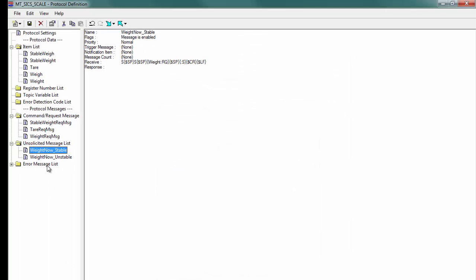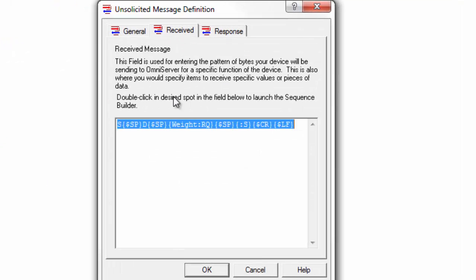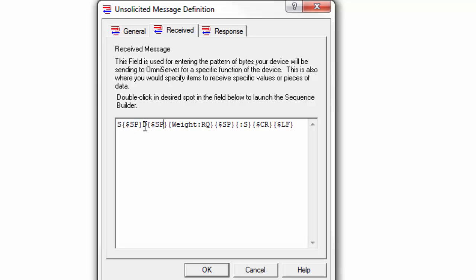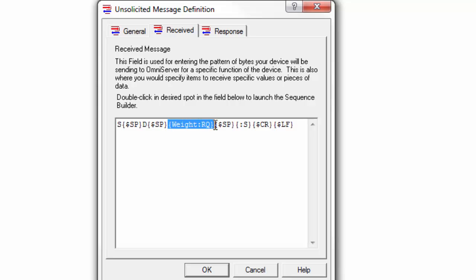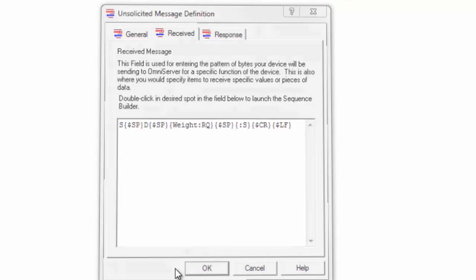We have a similar unsolicited message defined to receive the unstable weight. Again, a capital S, our space, our capital D, our space — you define that same item again the way we did in the previous unsolicited message — another space, and we're using the sequence with curly brackets around the colon S, which is the string data type syntax, to ignore a variable number of characters up to the carriage return and line feed that terminate the message. The weight value we get back from the device — whether it's stable or unstable — gets parsed into the weight item, and that weight item is what you'll be referencing from your client application.